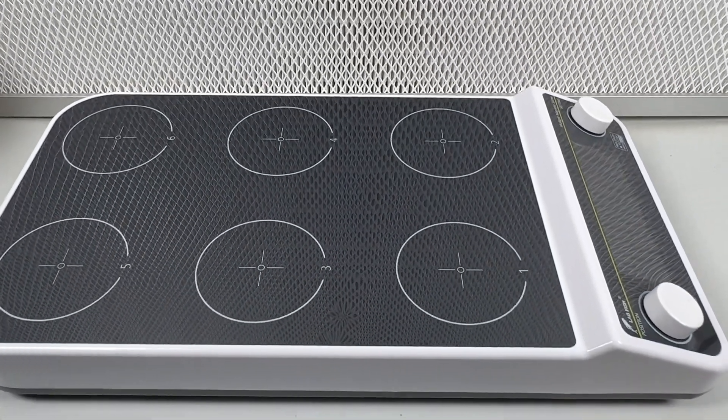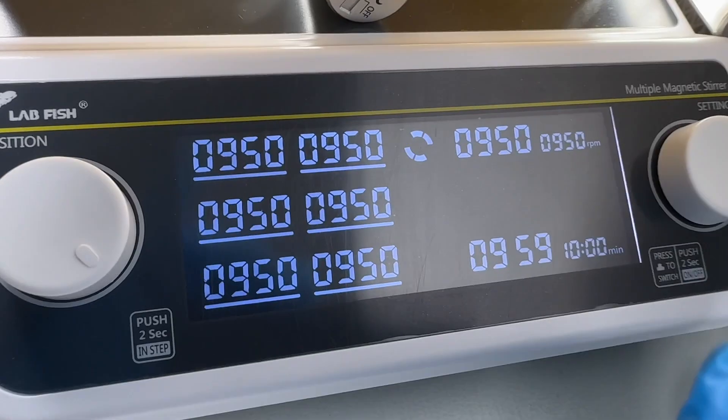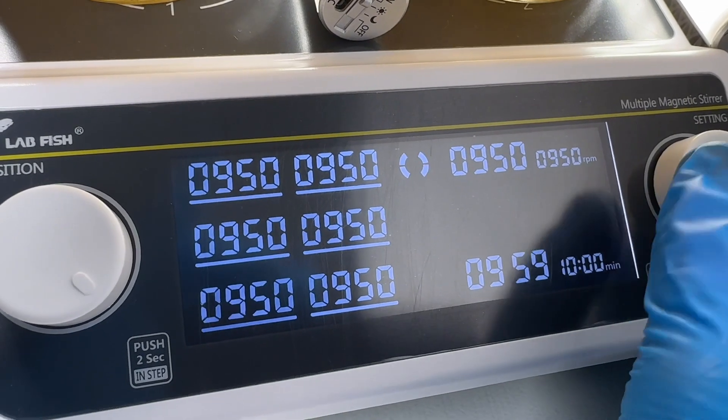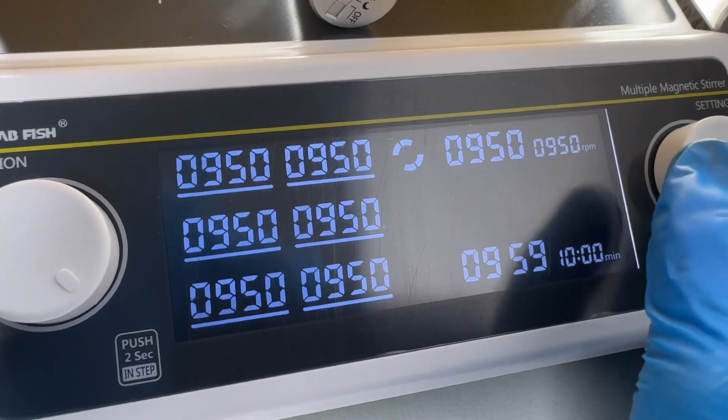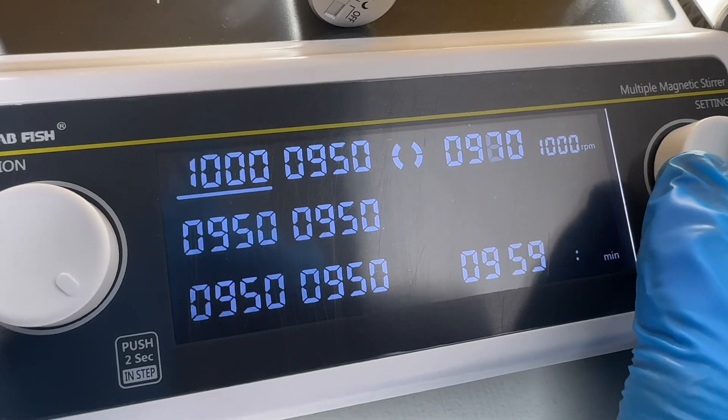I bought it from Amazon for $300 during the recent Amazon Prime Day event. I love the large display where you can program each individual position by using these knobs.